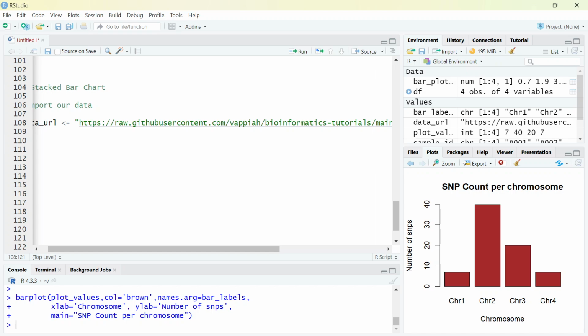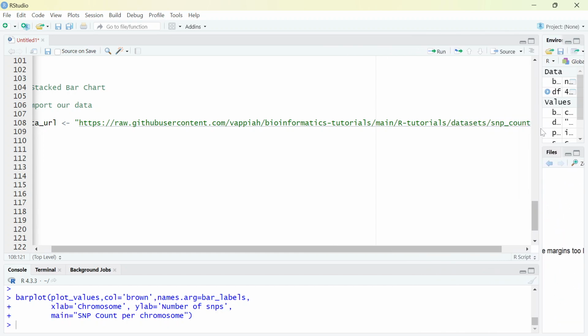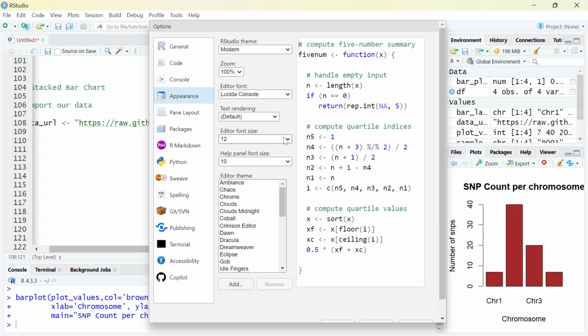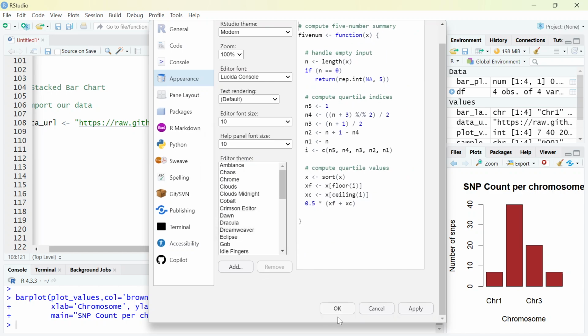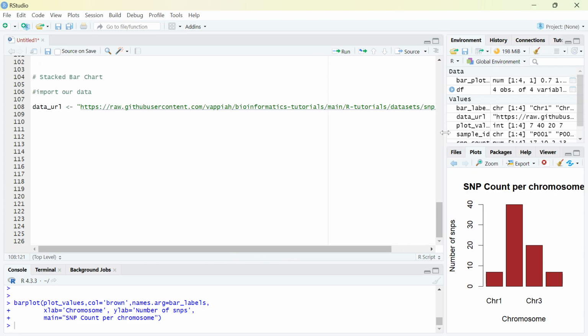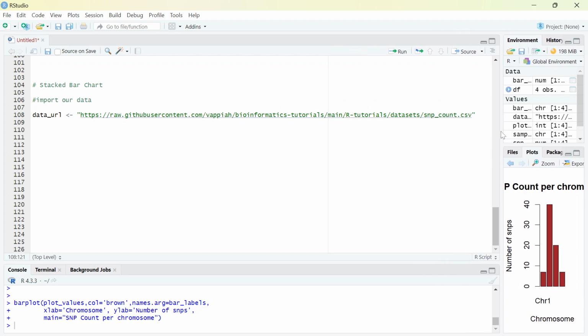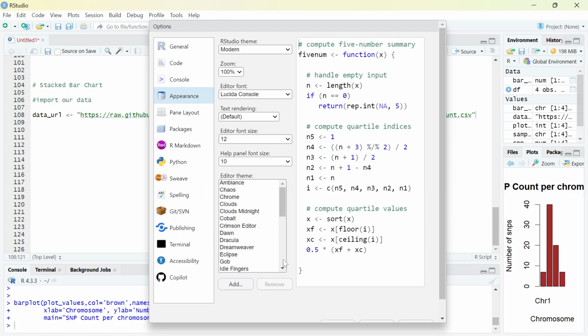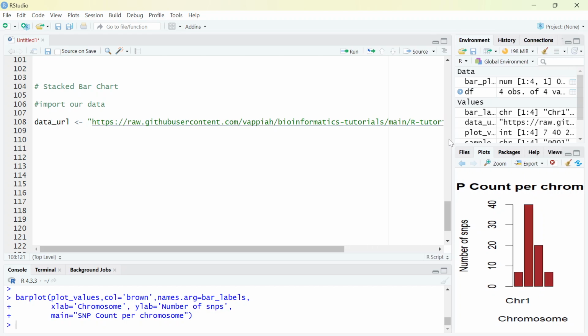I repeat, this is what we are going to get. I'll just go back again and change the font size so that we see how it is supposed to be done. We're going to have something like this, whereby you have a single or double quote. Here I'm using double quotes, so let's keep it this way. You have your double quote, you paste the URL link, and then after the link has been pasted, you add another double quote to close it. So this is what you should have. Now I will revert back to my old font size so that the text becomes bigger for us.